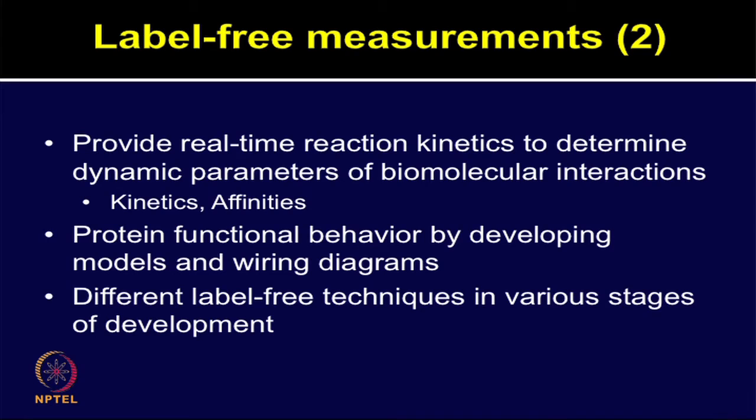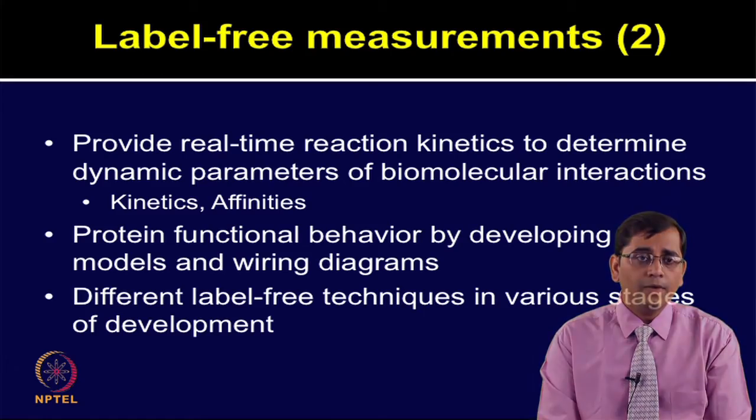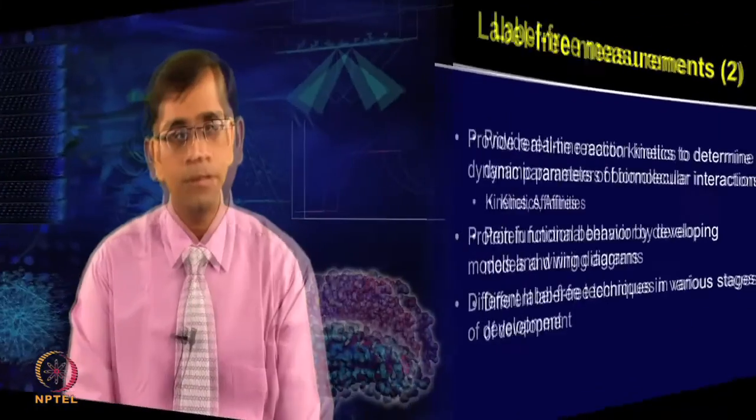The protein function behavior can also be studied by developing models and wiring diagrams once you have obtained the kinetic parameters from these experiments, which is not possible by label based methods. The different kinds of label free techniques are currently at various stages of development.